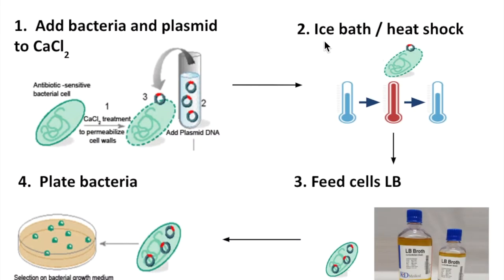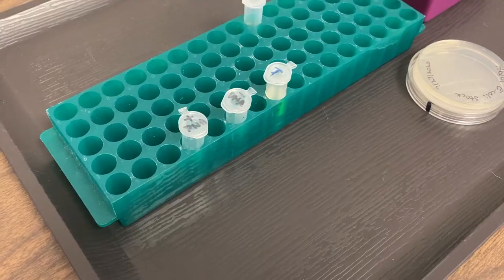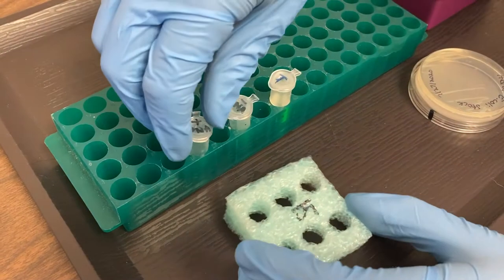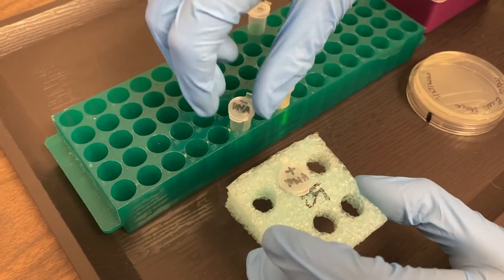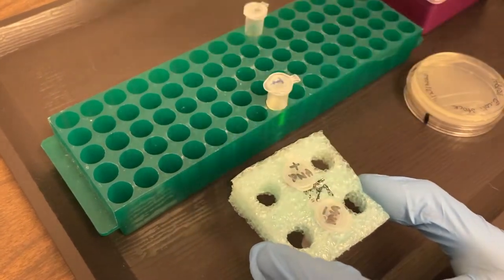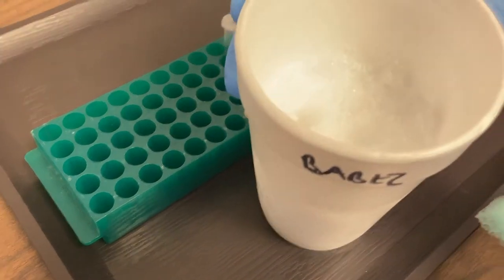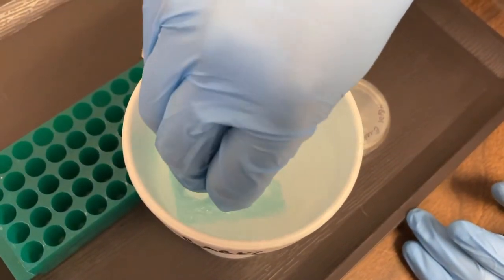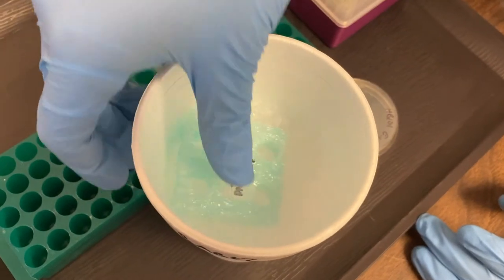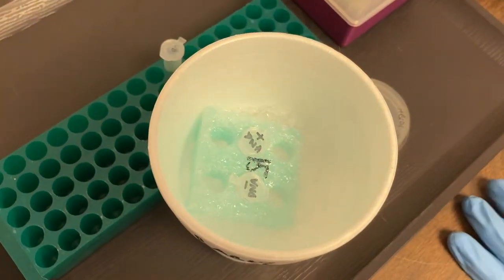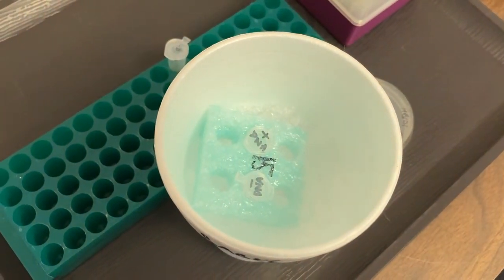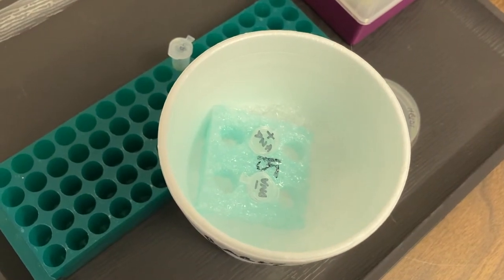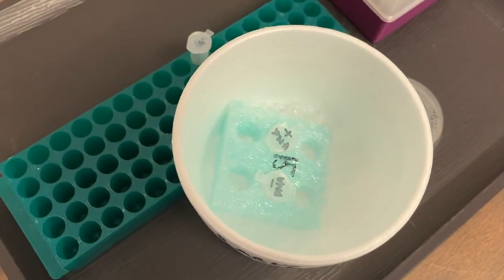Now we're going to move on to part two which is the ice bath and then the heat shock. So we're going to take both of our tubes and use a styrofoam floaty to put them in our ice bath. Now technically that's crushed ice which works fine. You can use ice cubes with a little bit of water to create a water bath as well. It's important that both of the tubes are deep down into the ice for this incubation. We're going to leave them on ice for 10 minutes.